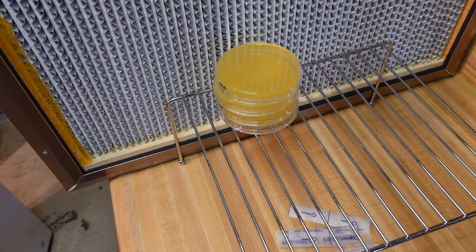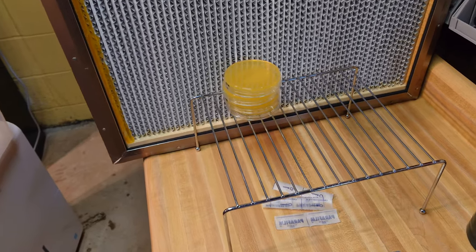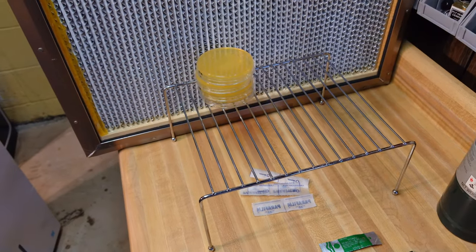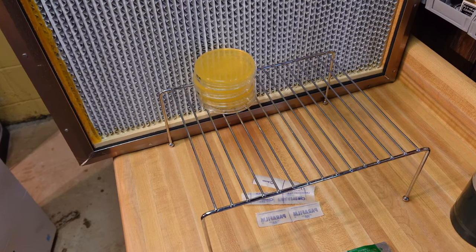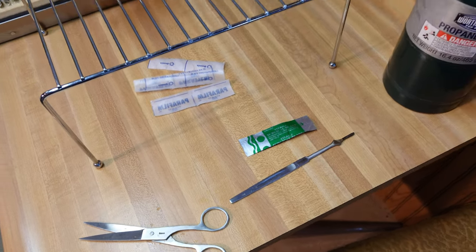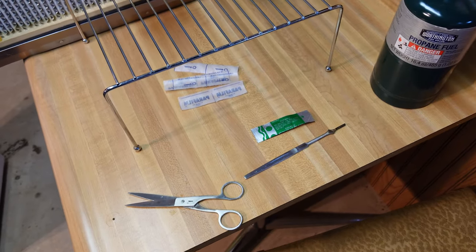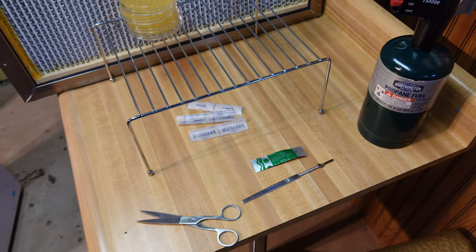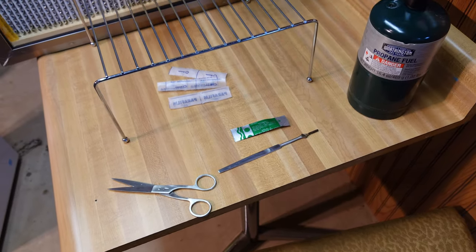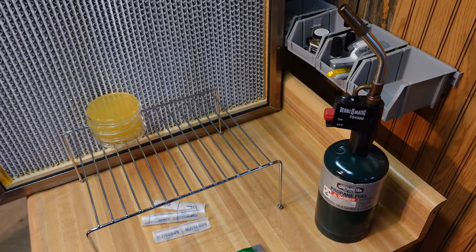I have four sterile agar plates here - light malt extract agar - and those are what our little pieces of hopefully sterile tissue of Hericium coralloides are going to go onto. I have strips of parafilm cut up ready to go to seal our petri plates once we get tissue on there. That's going to keep contaminants out. I have a scalpel, a sterile scalpel blade, a propane torch. The sterile scalpel blade is sterile right out of the package, so for the first transfer I won't have to use the flame, but for subsequent transfers we will be sterilizing with the propane torch.